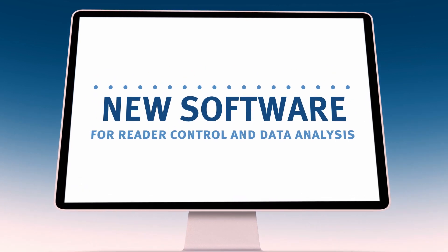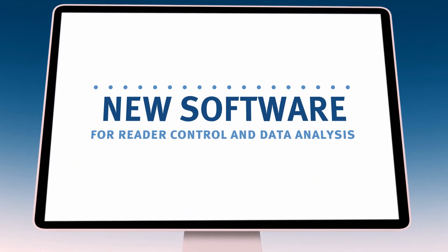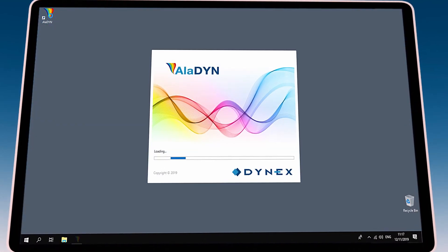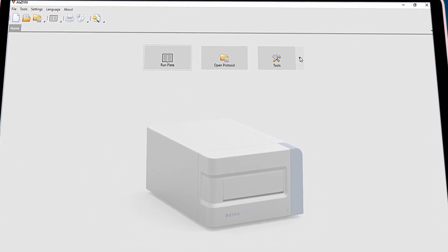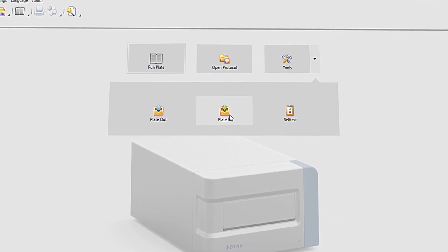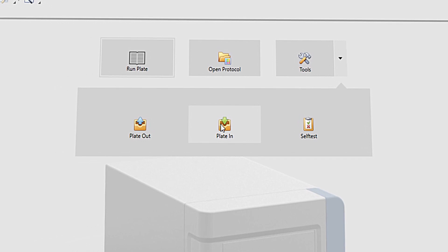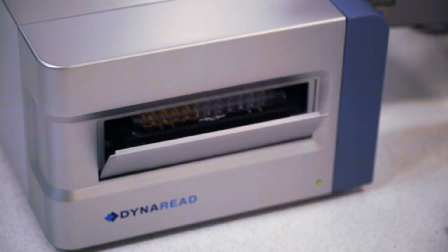We are introducing our new software for reader control and data analysis: Aladdin. It combines intuitive ease of use with a powerful analytic base. We've developed Aladdin to fit clinical and other routine testing applications, as well as most research needs. Measuring couldn't be faster while using user-defined protocols.